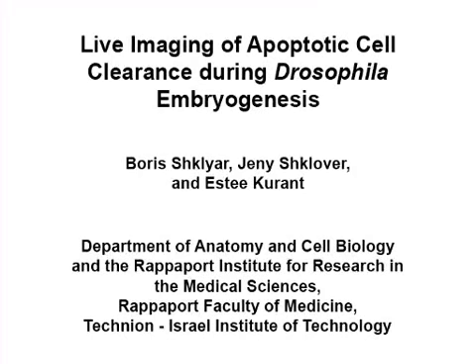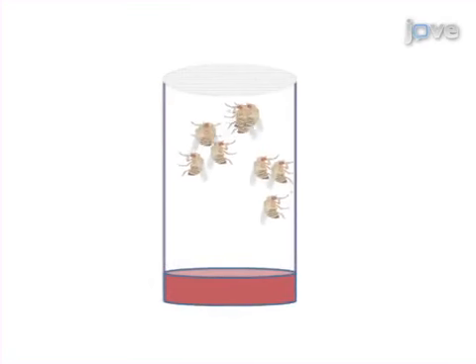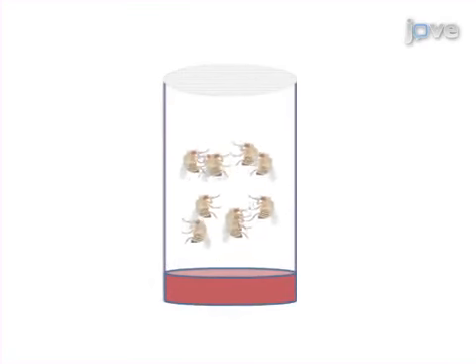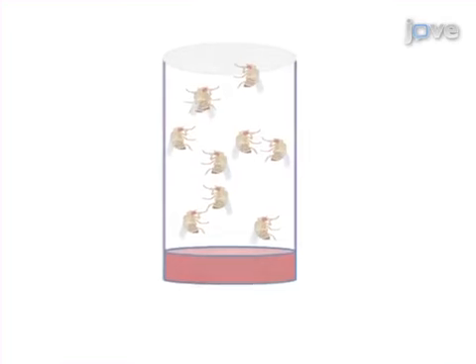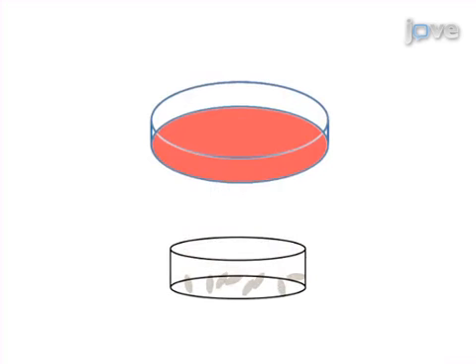The overall goal of this procedure is to follow the dynamics of apoptotic cell clearance in the Drosophila embryo. This is accomplished with transgenic flies containing a simu-cytoplasmic GFP marker, which labels phagocytic cell populations. Embryos with the simu-GFP marker are collected, washed, and dechorionated.